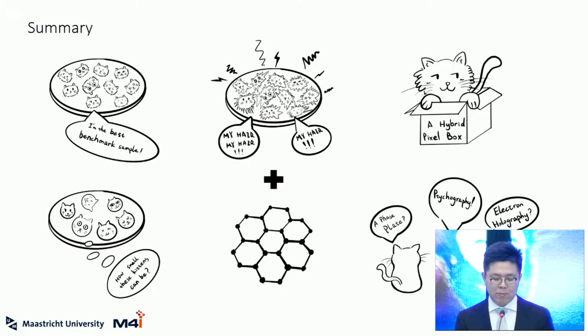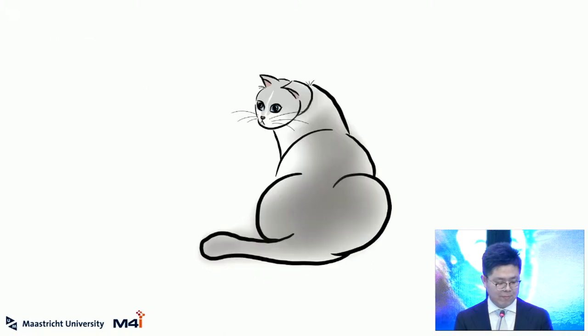So we hope our research could help to expand the limits of cryo-EM in structural biology, so that we can visualize a larger range of protein structures at higher resolution in more conformational states, and so that we can have a better understanding of the building blocks of life.